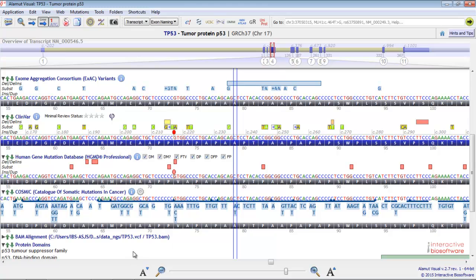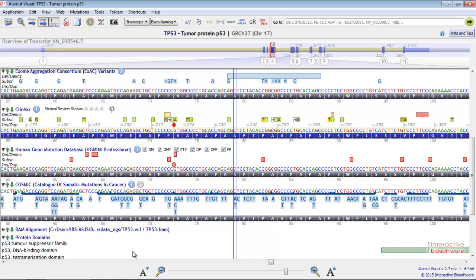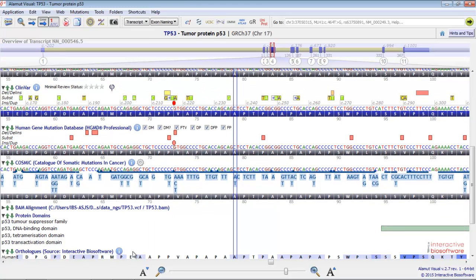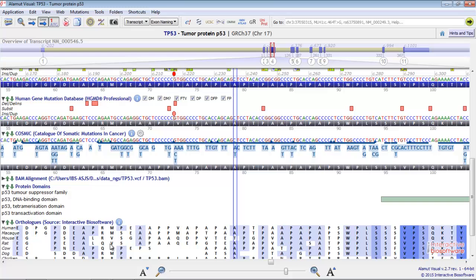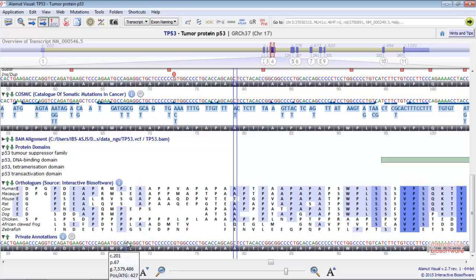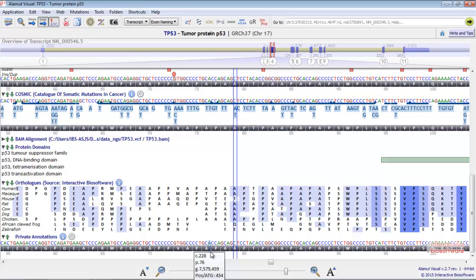This is the Protein Domains track, the Orthologues Alignments track, and finally the Private Annotations track where you can enter your own annotations.